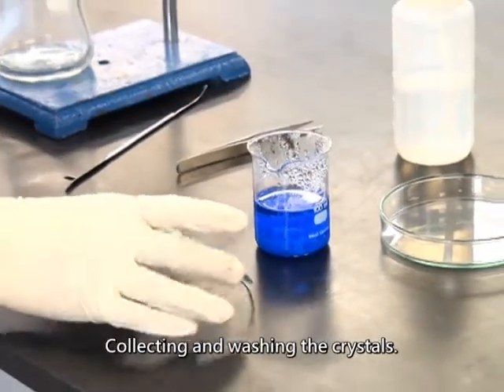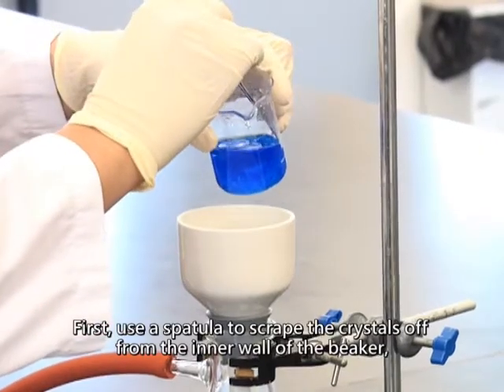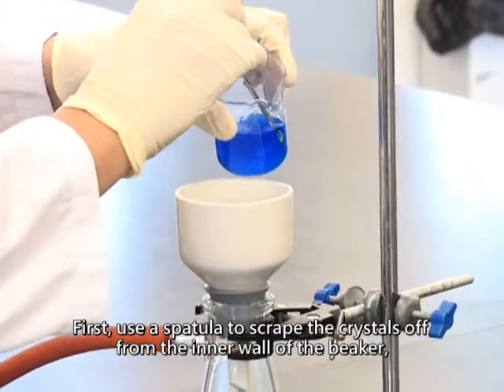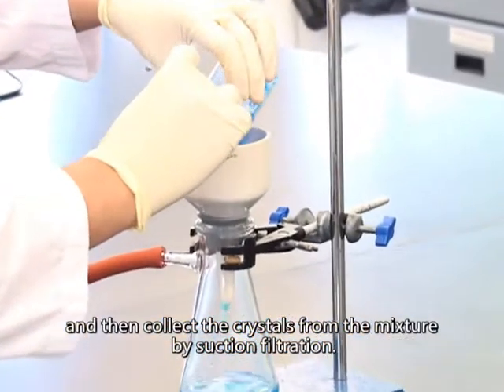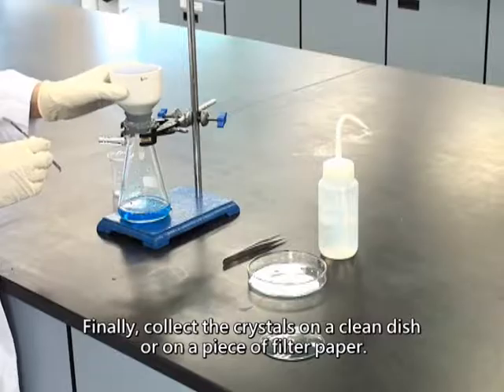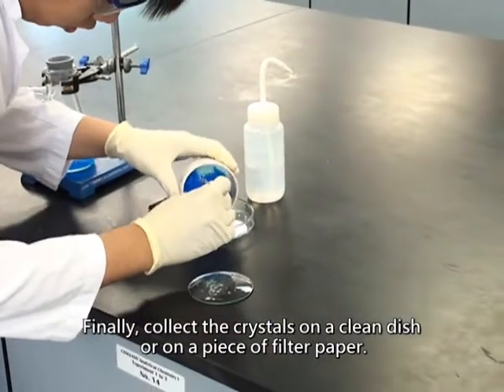Collecting and washing the crystals. First, use a spatula to scrape the crystals off from the inner wall of the beaker. And then collect the crystals from the mixture by suction filtration. Finally, collect the crystals on a clean dish or on a piece of filtered paper.